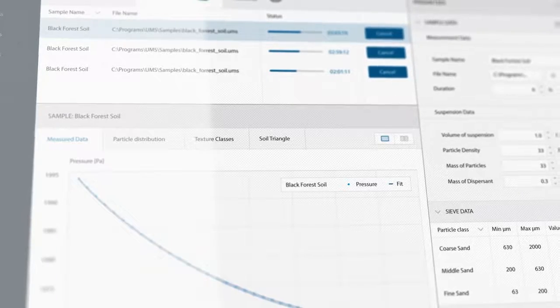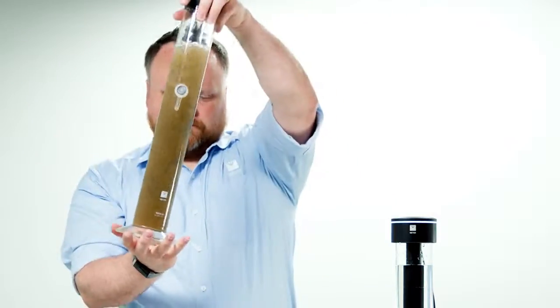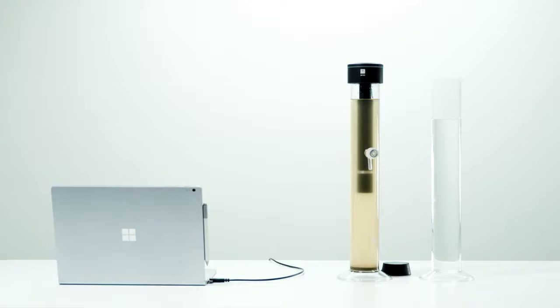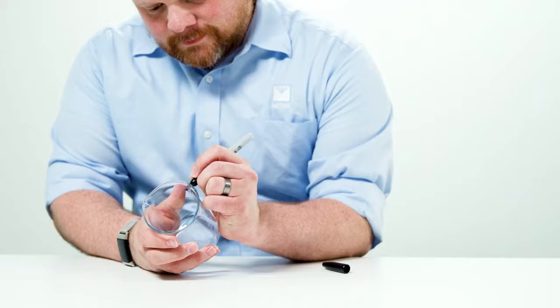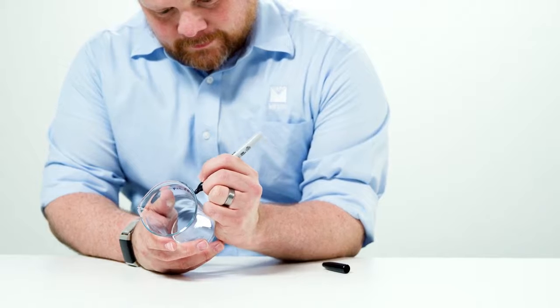in real time. If multiple PARIO devices are used, repeat the starting measurement steps for each sample. Switching windows in PARIO Control will not affect the running measurements. Leave the PARIO devices undisturbed for the duration of the measurement time. Make sure the empty sample beaker weight is recorded on a label on the beaker.